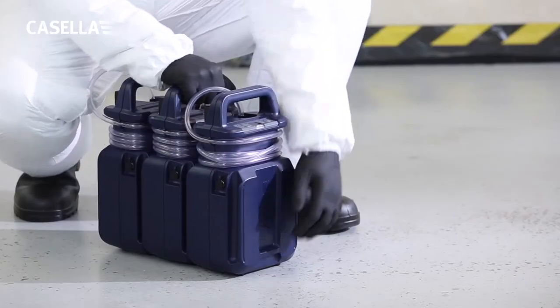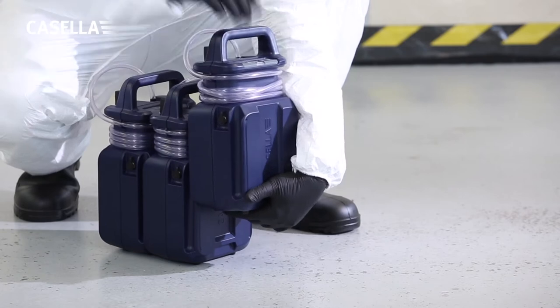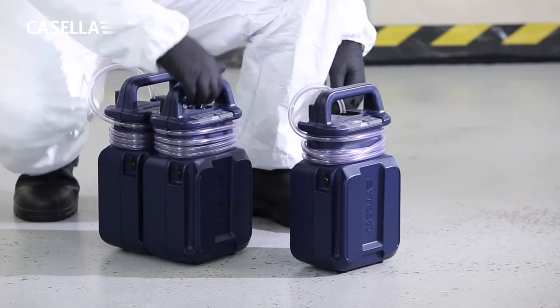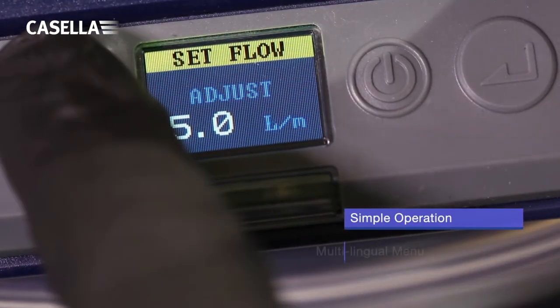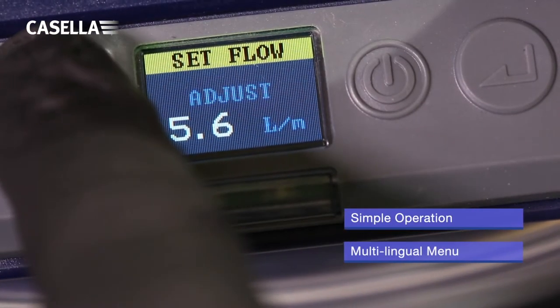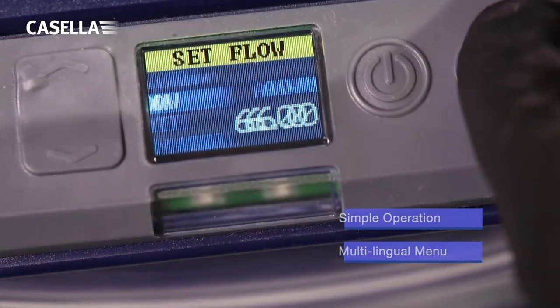The Vortex 3 high-flow air sampling pump is extremely easy to use and can be set up in minutes. With intuitive controls and a simple multilingual menu, calibration and setup is simple and easy.